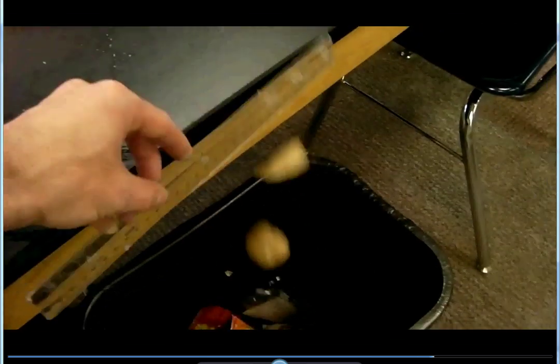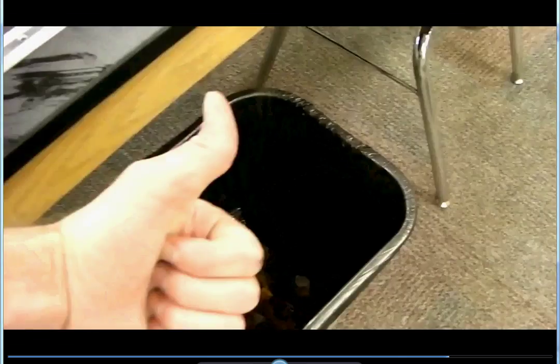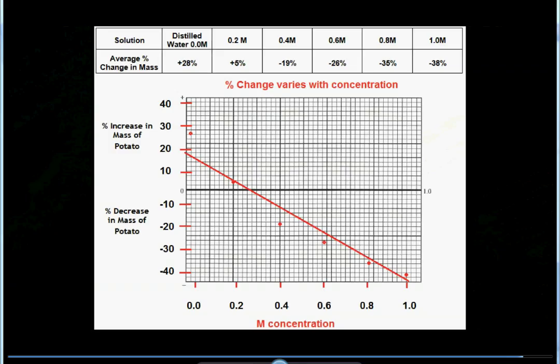But before you finish, you clean up the lab station right away and wipe down the table. Once again, right away. You guys would all be doing this. Nice job.